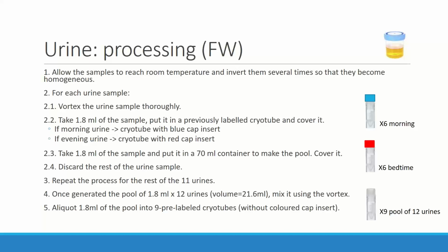For the cohorts, the space of the biobank is the main limitation. So you can store more aliquots, at least for athletes. We are proposing one aliquot for each morning and each evening urine sample, but you can always keep the 10 milliliters tube if you have space.